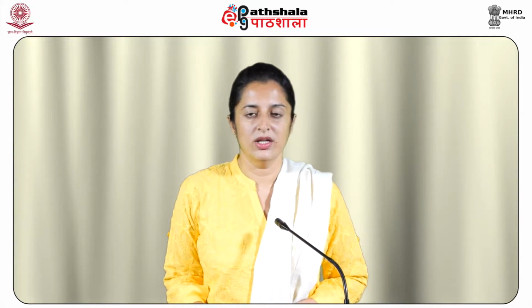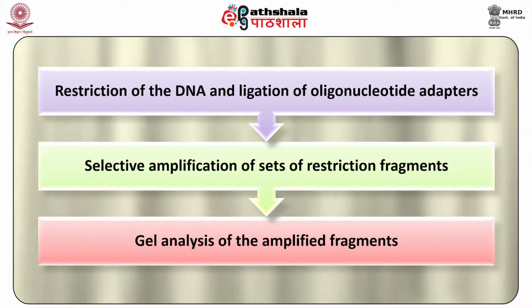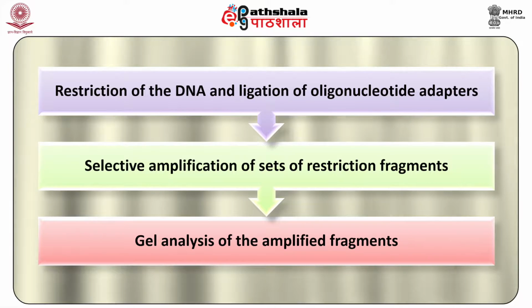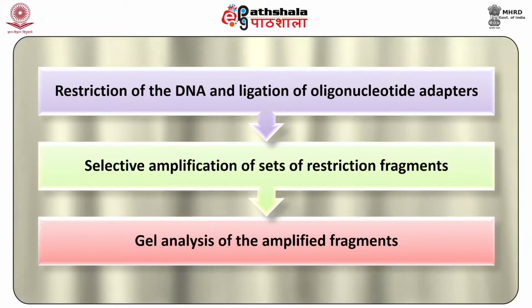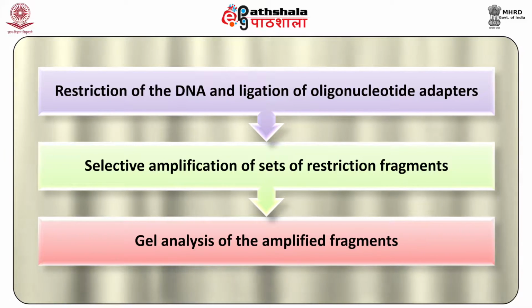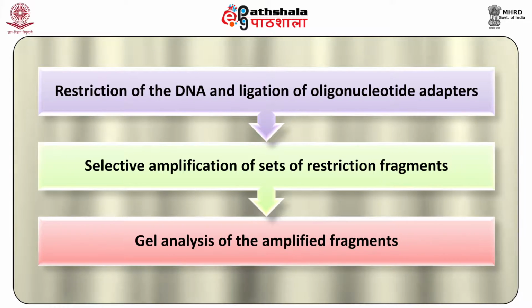Number 1, restriction of the DNA and ligation of oligonucleotide adapters. Number 2, selective amplification of sets of restriction fragments. And number 3, gel analysis of the amplified fragments.